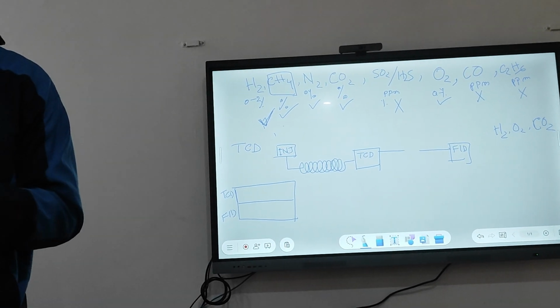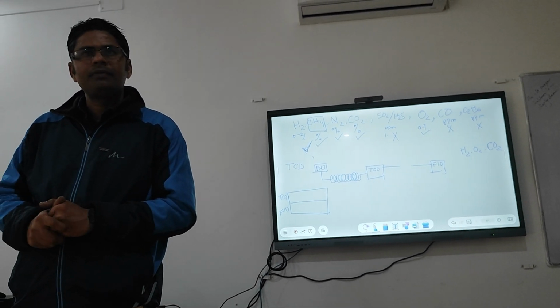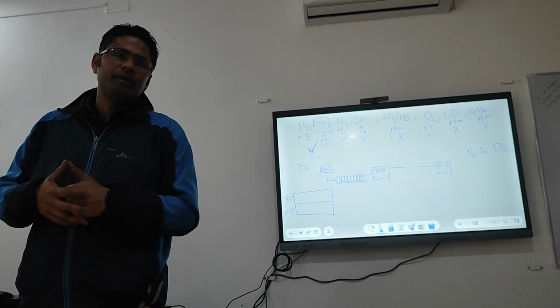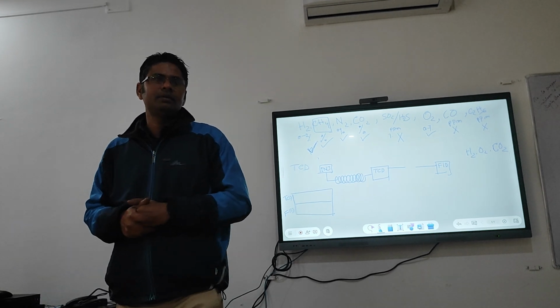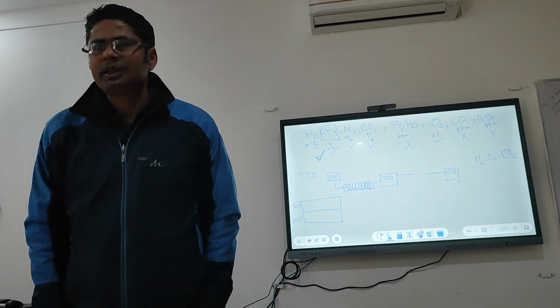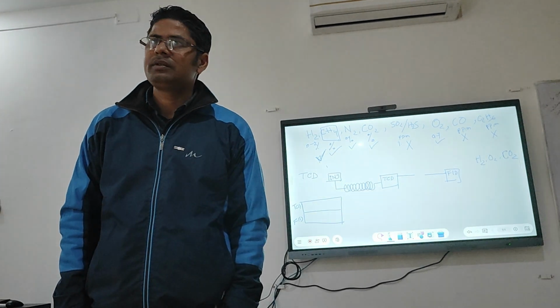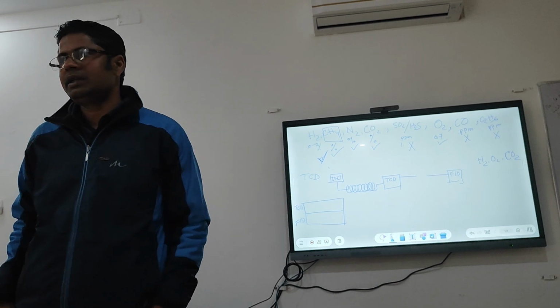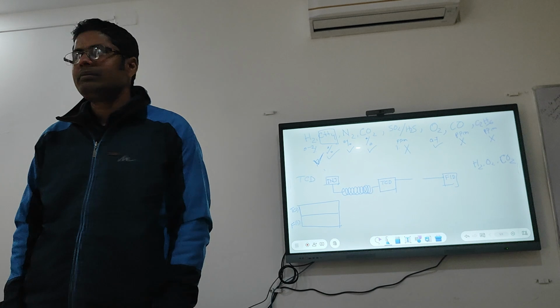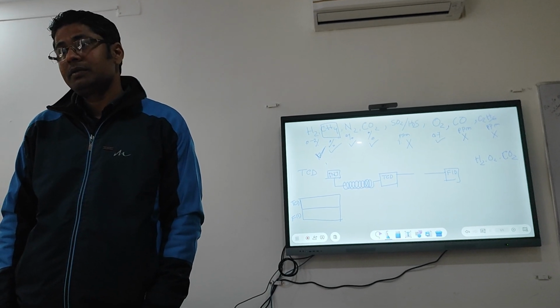So hydrogen, oxygen, CO2, among three components, which component will elute first? Hydrogen. Okay. Then oxygen. Okay. Then CO2. On which basis are you telling this? Mass. Mass by charge ratio is an MS property and it is a detection related thing, not elution or separation related. M by Z is a detection related thing in a mass detector. But we have to tell the column's properties.